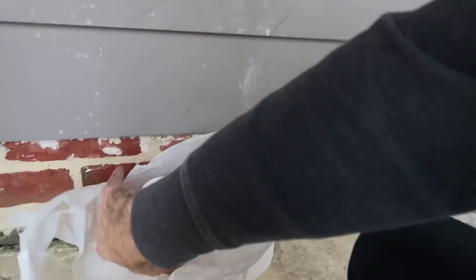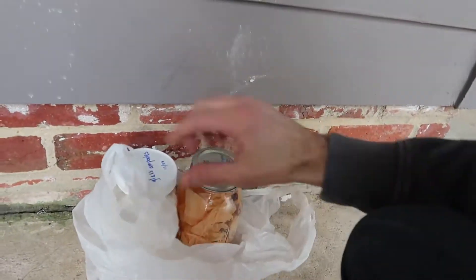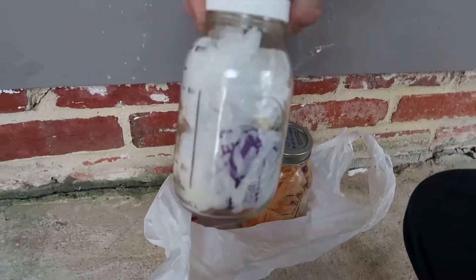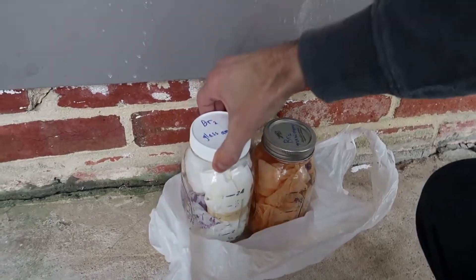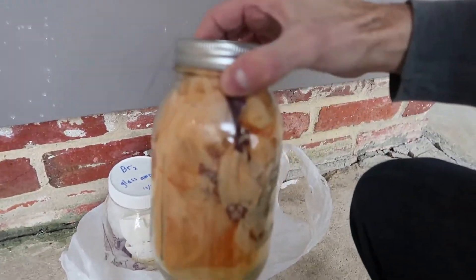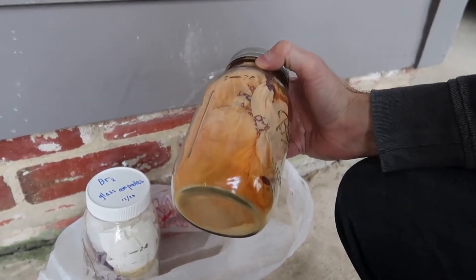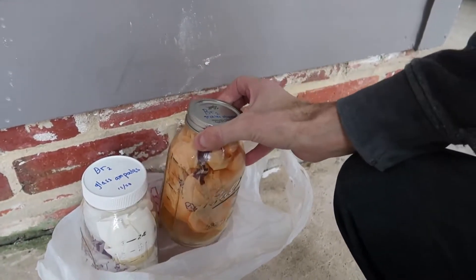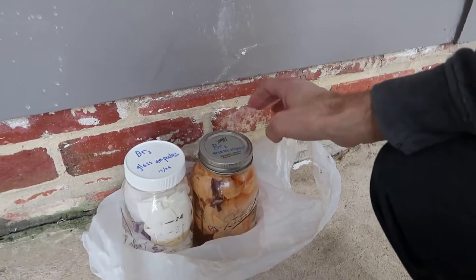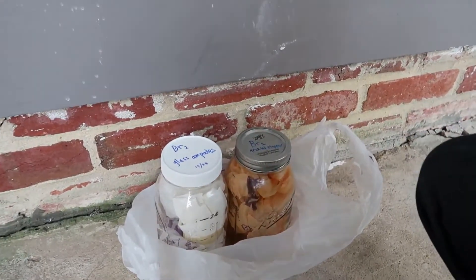It's been two or three days. The bromine in glass ampoules is perfectly fine - apparently those worked well. The bromine in a ground glass stopper with silicone grease on it - you can see the bromine is getting out of there. It doesn't smell too strongly, so it's pretty well contained, but it's getting out. So you definitely need the glass ampoules.